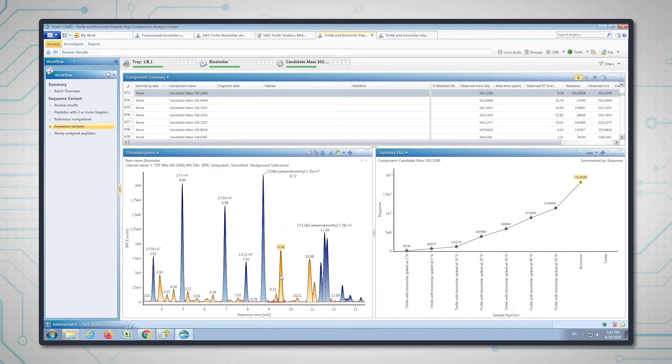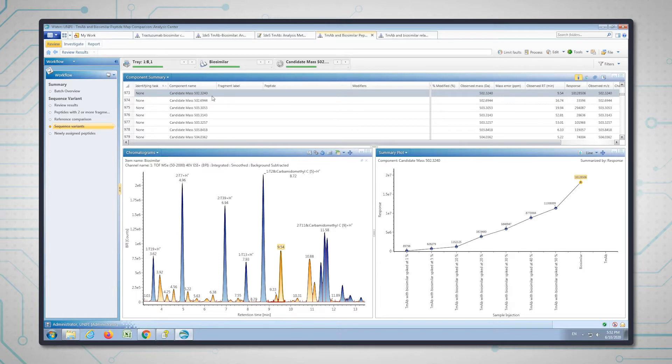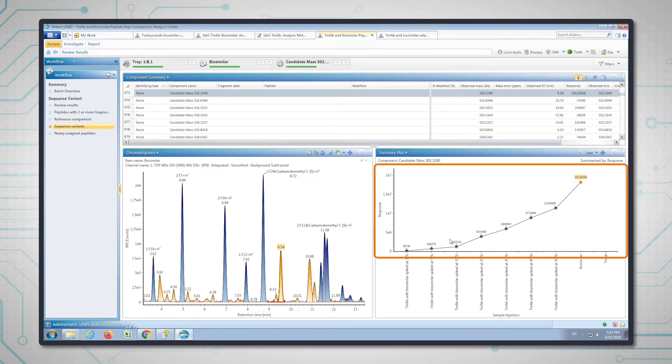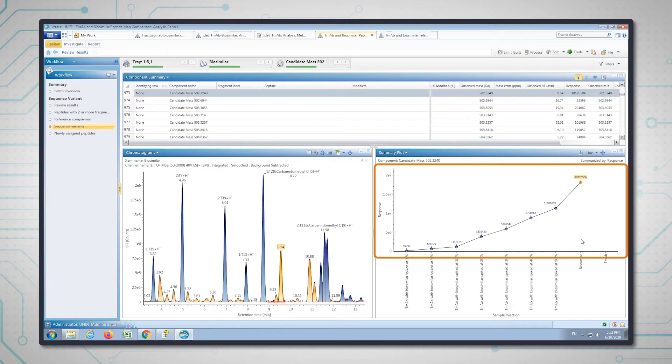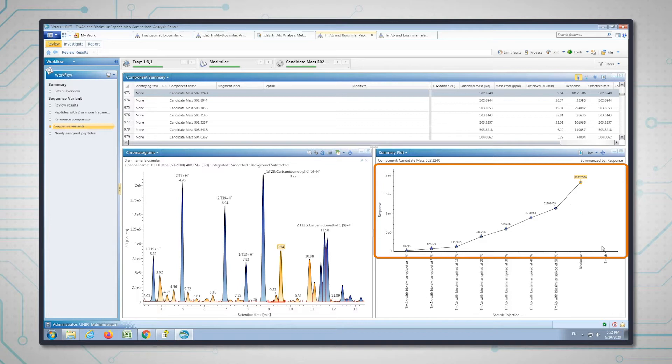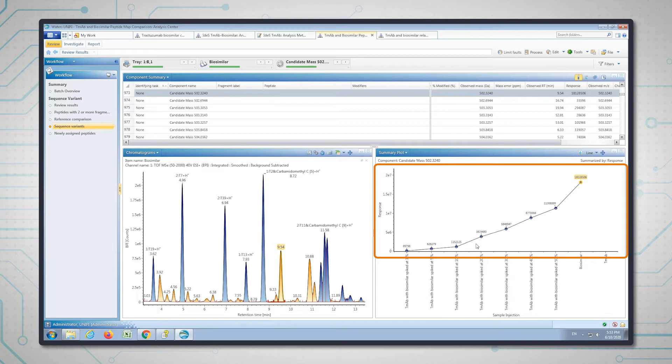We can see this has a candidate mass. In Unify, if a component isn't identified, it's given the name candidate. You can see here that we can use the summary plot to track the response of this candidate peptide throughout the batch of samples. If you remember, I've spiked in the biosimilar to the trastuzumab at different levels. You can see that this peptide follows that trend quite nicely—it's not present at all in trastuzumab, which is what we'd expect. It's there in the biosimilar and it goes down corresponding to the percentage that I spiked in. That's encouraging and gives me confidence this is actually a real peptide that's unique to the biosimilar.